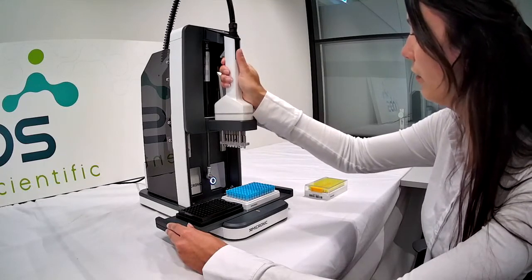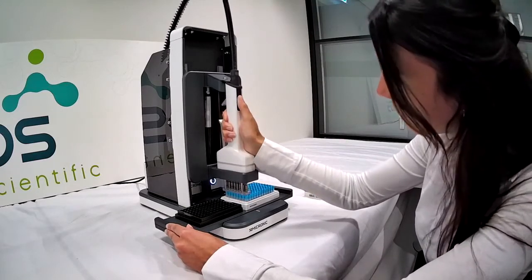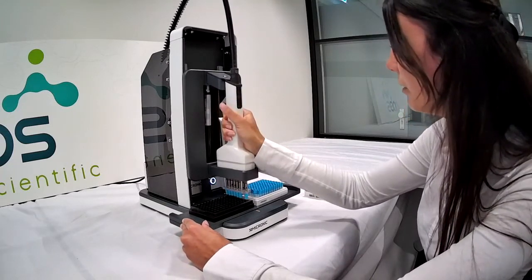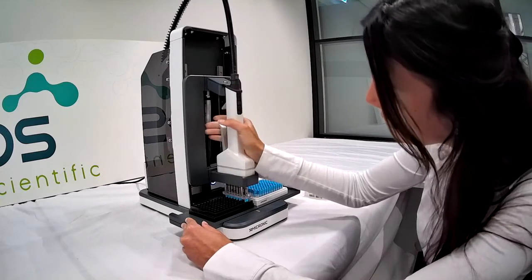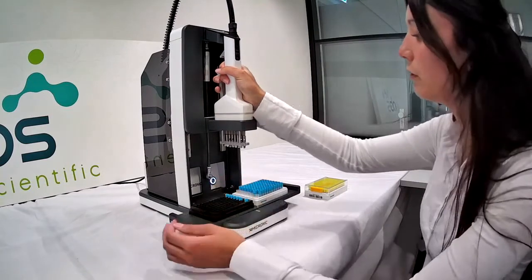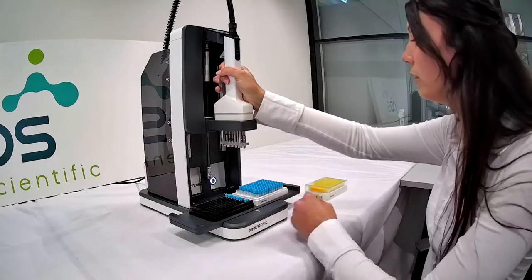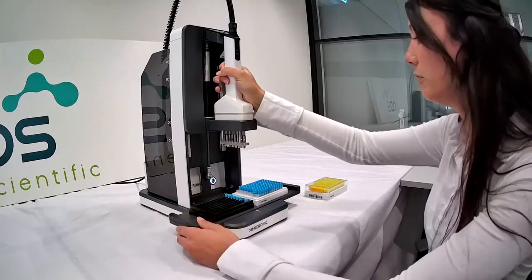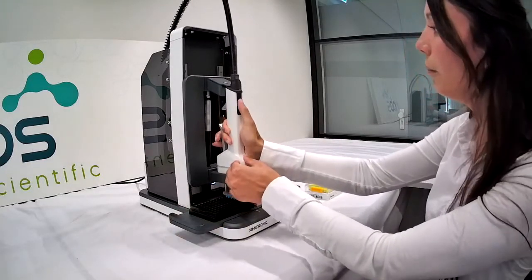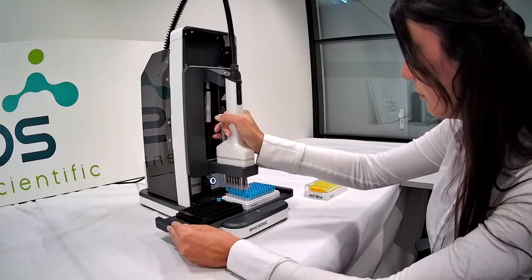So now I will go down with the system. You press it up. It has all the caps. Then it will go to the cap carrier, and you release it with the handle. So this is how it looks. Then you can fill your tubes, and if you're done with that, or you want to decap the whole rack, you place all the tubes inside. Afterwards, you press up, and then you go down.